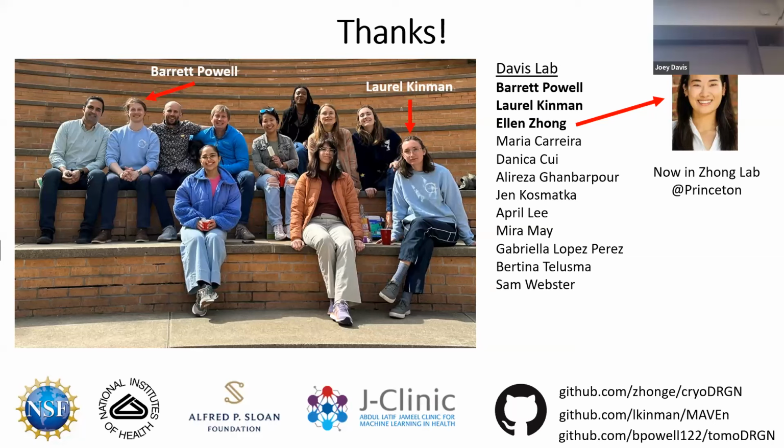Yeah, I think there are two problems. One is that you need to be able to pick them initially, and there's not a lot of signal to pick on. So you need things that are big that give a lot of signal. Ribosomes are great. Proteasomes are great. There's probably a few other targets there.